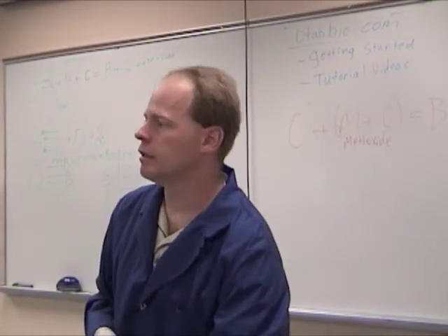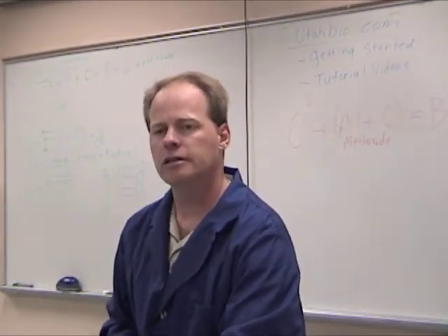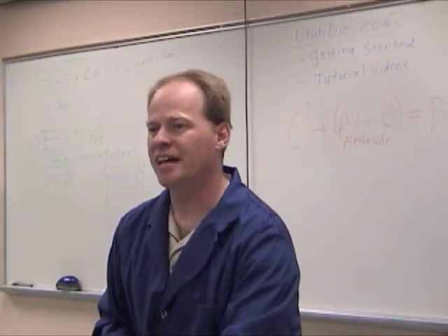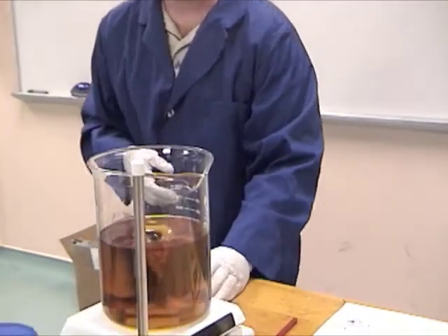I'm causing it to spin with a little mixer down on the bottom. Notice the color? It's turning to a really nice amber, isn't it? Okay, we'll mix this for a little bit more and then we'll shut it off and it'll move into something else.